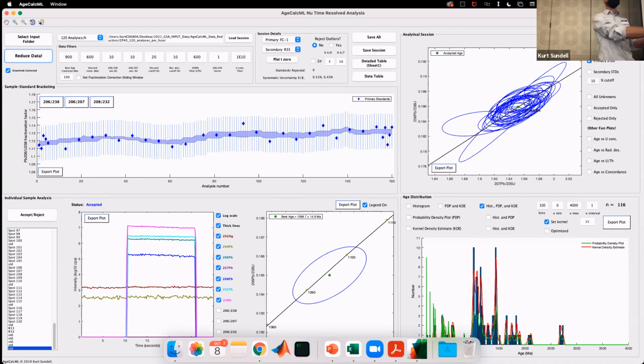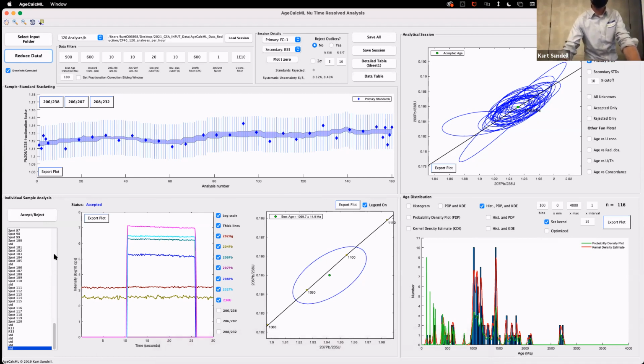You don't want to place your best age cutoff right in between that, because there's going to be this artificial shift in how precise and accurate your dates are. Sarah brought this up right when everybody came back. So that's what this one is. So we set it at 900 by default, but if you somehow have a lot of 900 million year grains or anything around that, you want to move it to somewhere where you don't have a lot of dates.